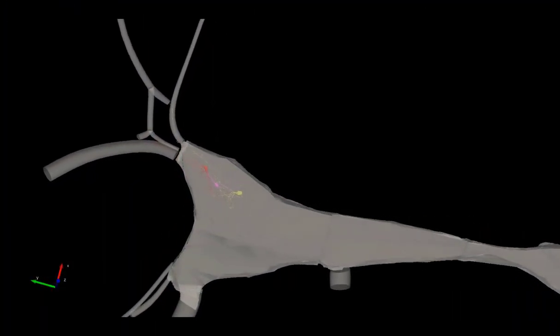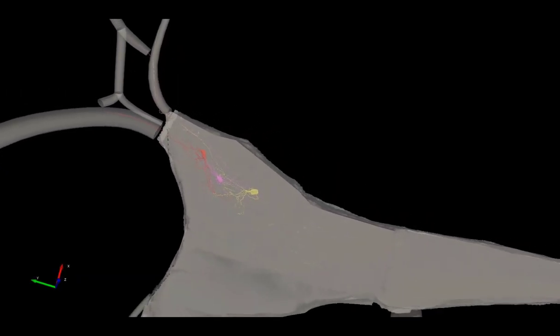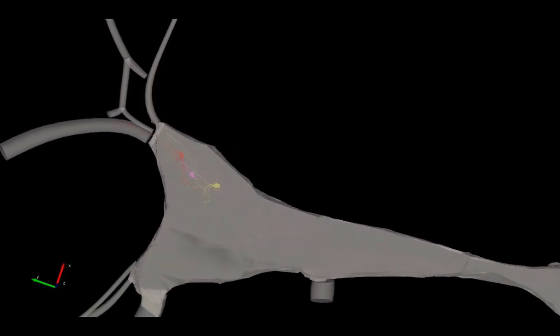This data file can be used to enrich the generic stellate scaffold with fiducial information, and the morphological and physiological data can be registered to a stellate scaffold for visualization on the SPARC data portal.